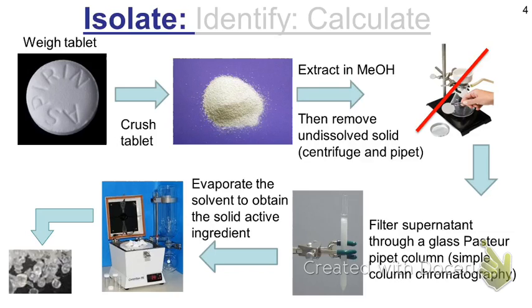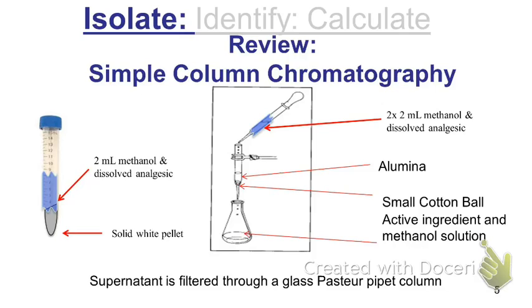Okay? You need to isolate the crystals of your compound. You need to get rid of the solvent. What's the easiest way to get rid of most solvents? Anybody? Does that get rid of the solvent? Evaporate. Okay, it is on there. So what we're going to be doing is evaporating the solvent. We're going to use some fancy new equipment, which in theory should make it go faster. It's called the Centrifan. We'll talk about that in a little bit. At the end of that process, you should end up with solid product. You'll take that solid product and do an identification process on that.